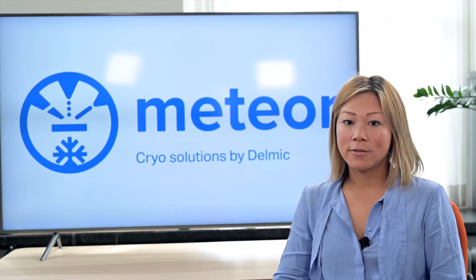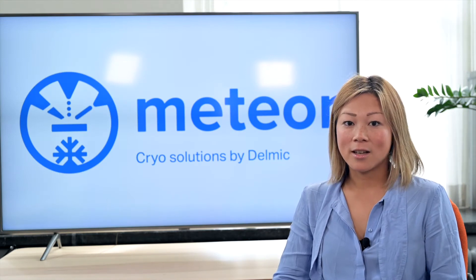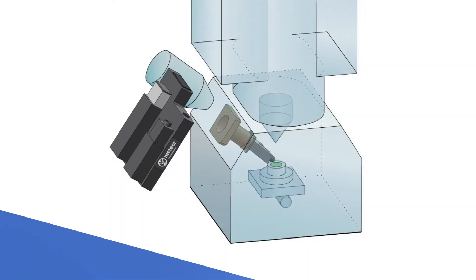METEOR is the first commercially available integrated fluorescence microscope module that can be fitted into a cryo-FIB-SEM chamber.